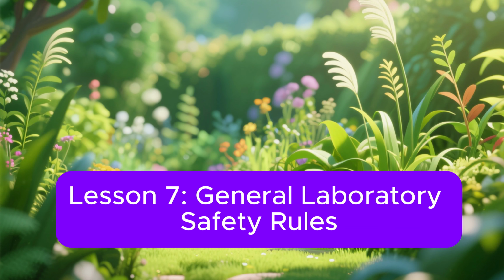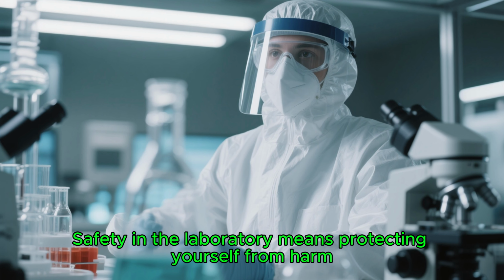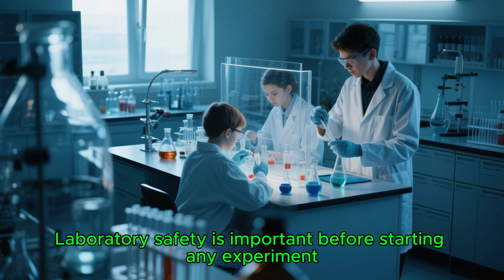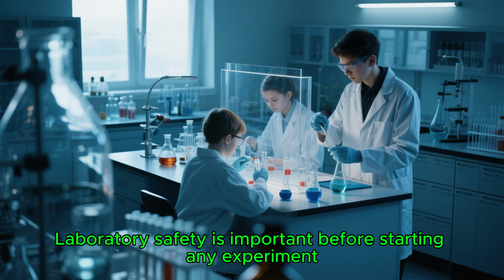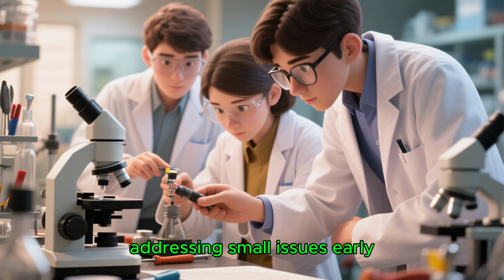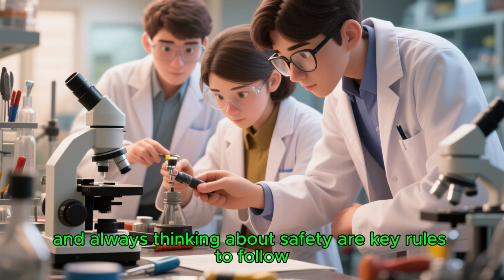Lesson 7. General Laboratory Safety Rules. Safety in the laboratory means protecting yourself from harm. It involves controlling risks to keep everyone safe. Laboratory safety is important before starting any experiment. Working carefully, addressing small issues early, and always thinking about safety are key rules to follow.